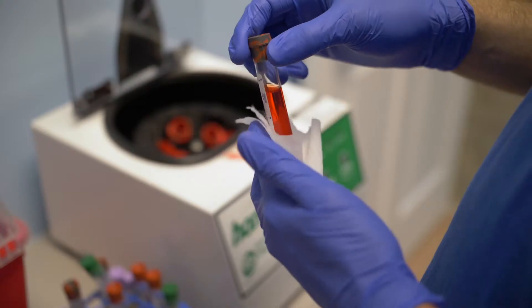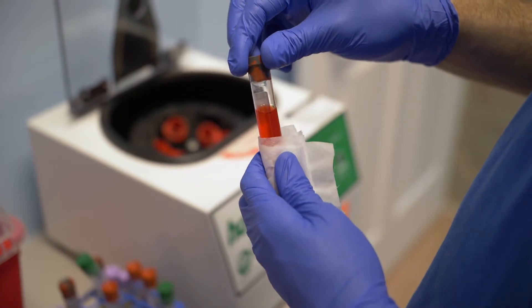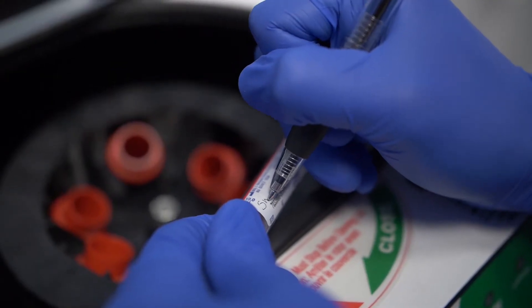Making an aerosol of your sample can be hazardous to your health and the environment. In addition, it can lead to loss of precious samples. Wipe the outside of the tube with disinfectant before placing it in the centrifuge, and clearly label the tubes for identification.